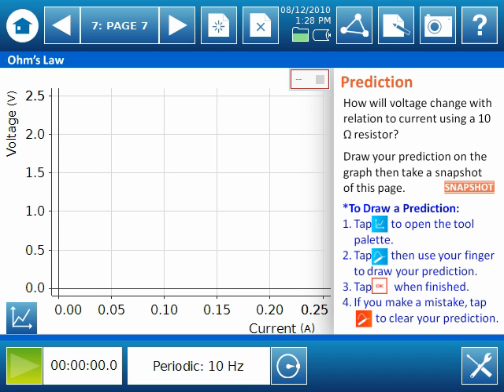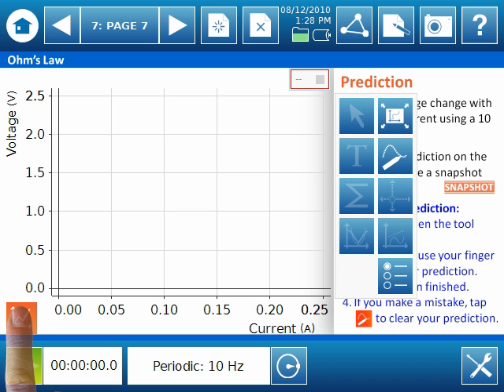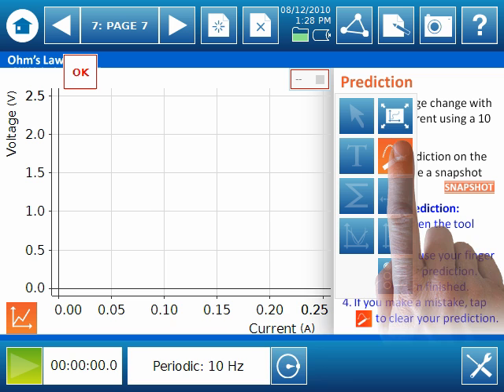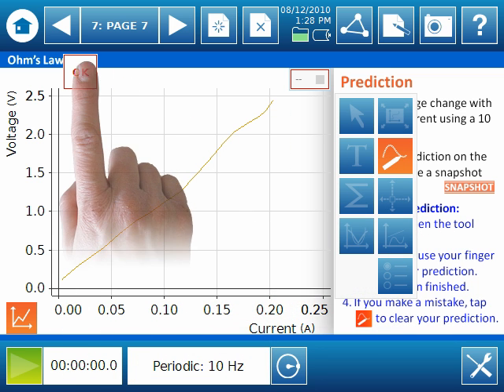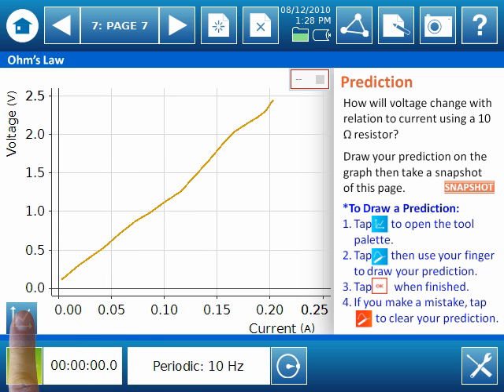So, following the instructions, I first select the Graph Tools Palette button to bring up the Graph Tools Palette. Then, I select the Prediction tool and draw my prediction right onto the graph. When I'm finished, I select OK. I see the snapshot icon on this page, so I'll go ahead and select the snapshot button to capture this page and add it to the journal.